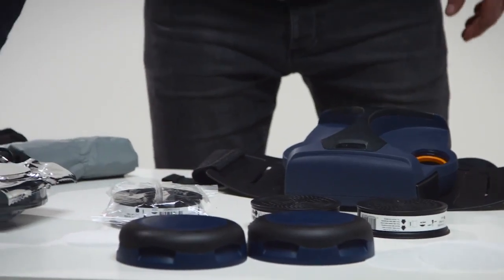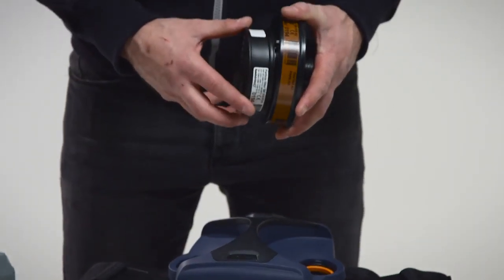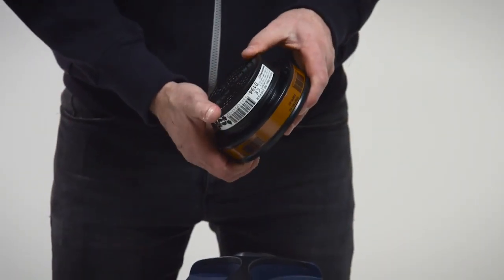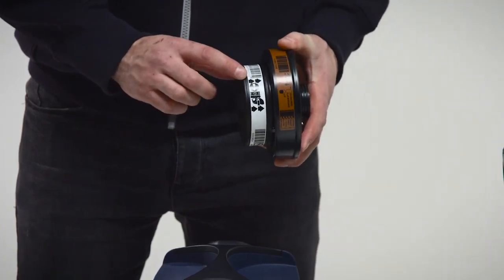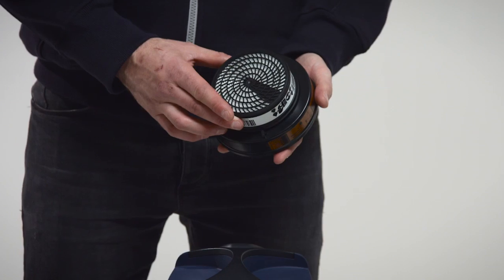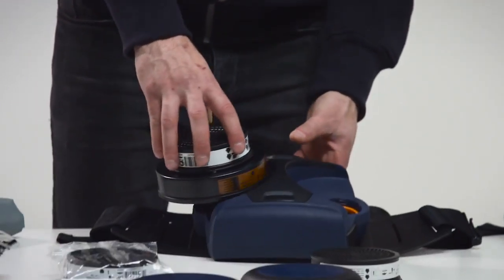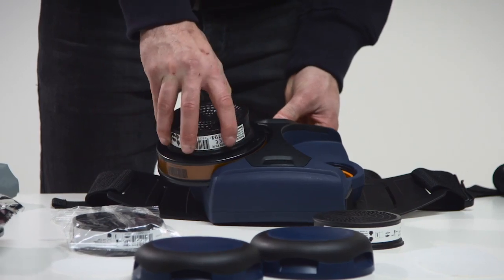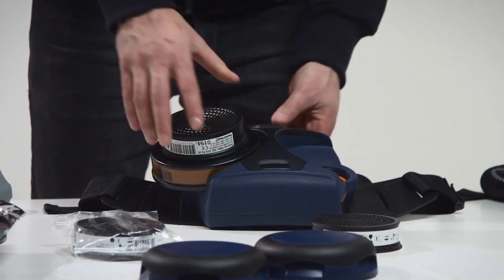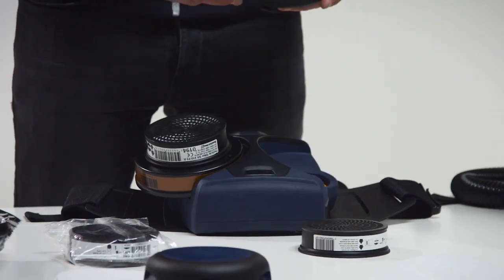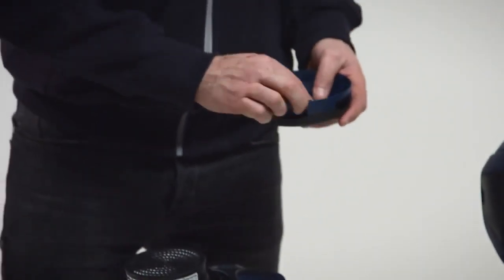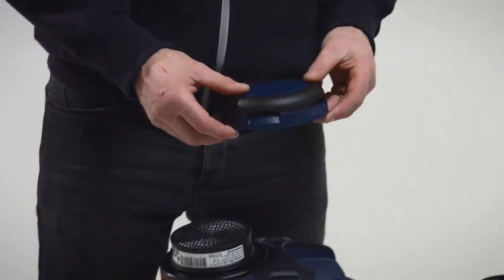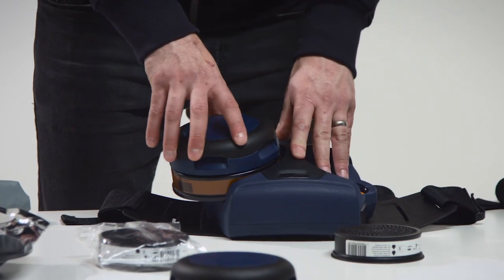Combined filters. Snap the particle filter onto the gas filter. The arrows on the particle filter must point towards the gas filter. Do not press onto the center of the filter. It might damage the filter paper. Screw the combined filter into the filter mounting until it is in contact with the gasket. Then turn it about one eighth turn further to ensure a good seal. Fit a pre-filter into the pre-filter holder. Press the pre-filter holder onto the combined filter.